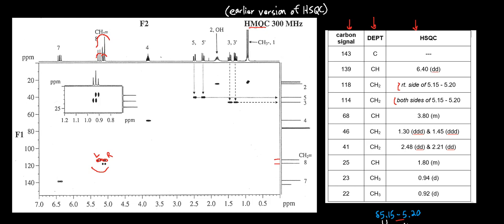The other thing that is revealed by HMQC is that if you were to expand on these 2 methyls, they actually correlate to different carbons, 22 and 23, only 1 ppm apart, but still distinguishable. And so in fact, it appears as though what we thought was a triplet was in fact a doublet and another doublet overlapping so that it appeared to be a triplet because of overlap in the middle. So it's actually a pair of doublets very tight together.